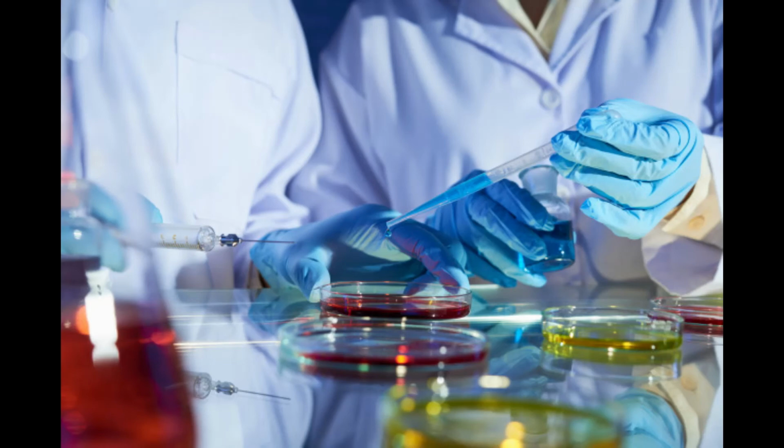You will grab your first loop. You will dip it into your Serratia marcescens. You're going to come over here to one of your imaginary quadrants, and you're going to streak the Serratia there into one of the quadrants. And you'll do a heavy streak, right? I've done a light one here. You'll do a heavy streak. So streak it onto quadrant 1.